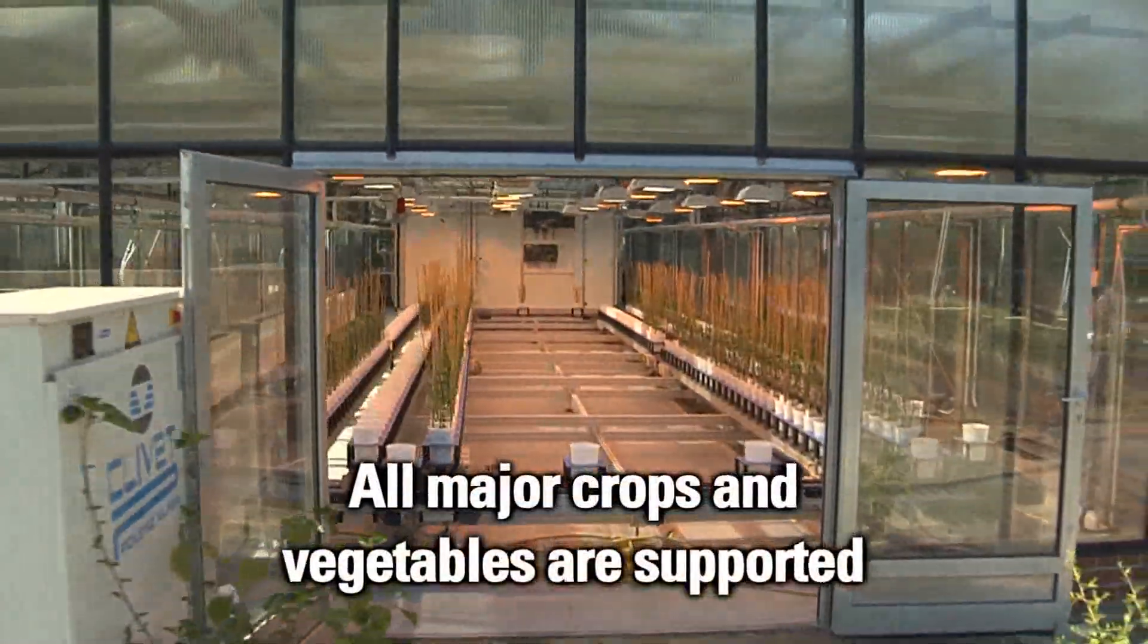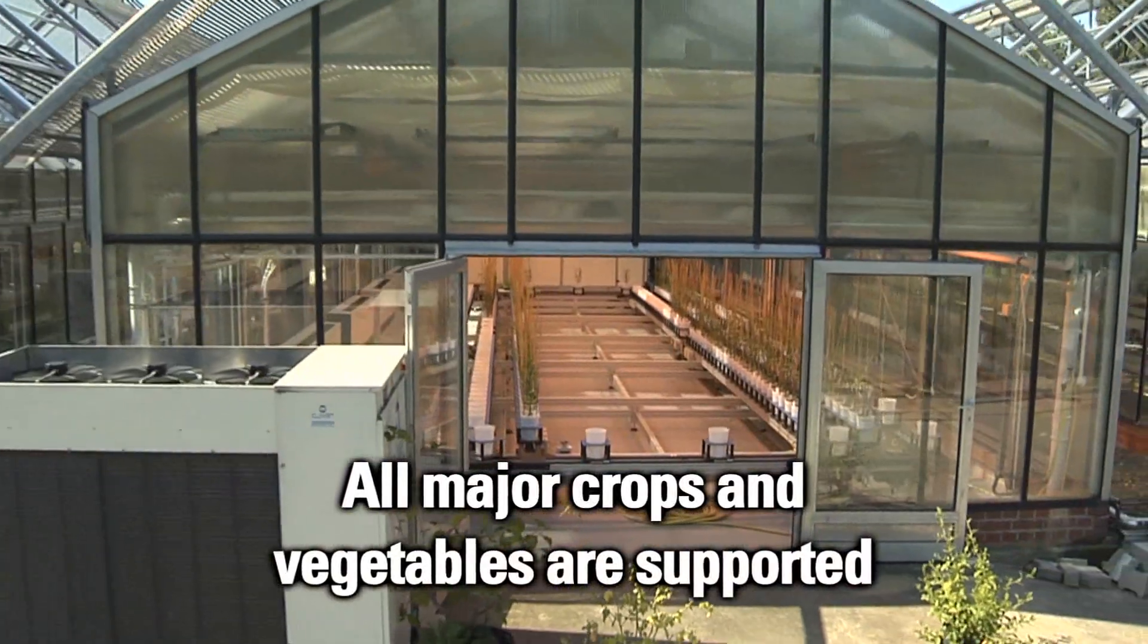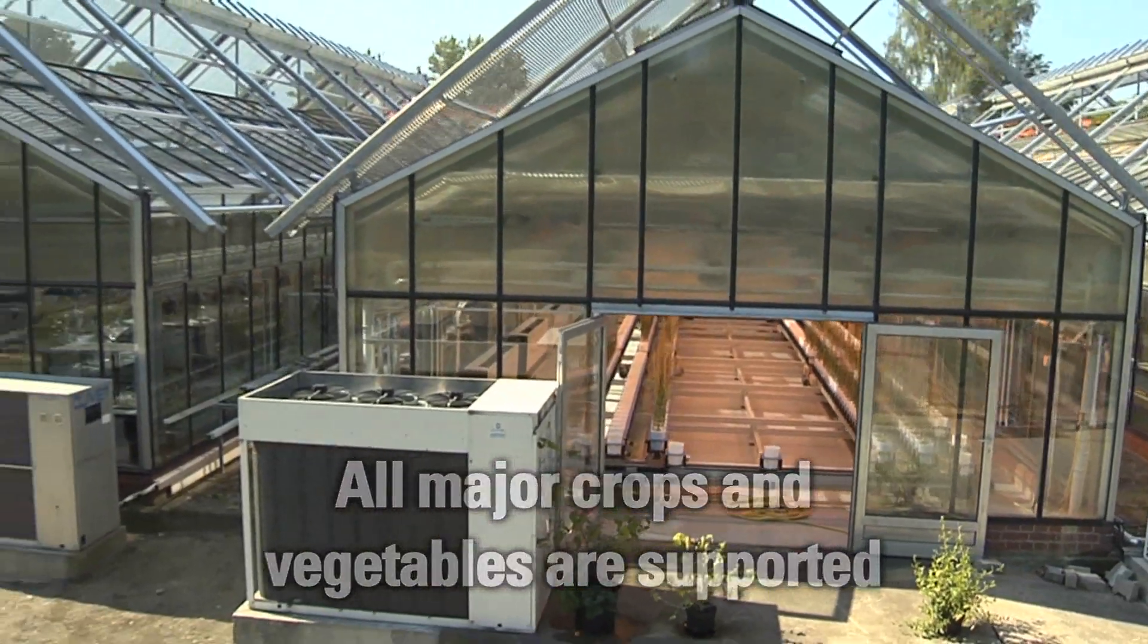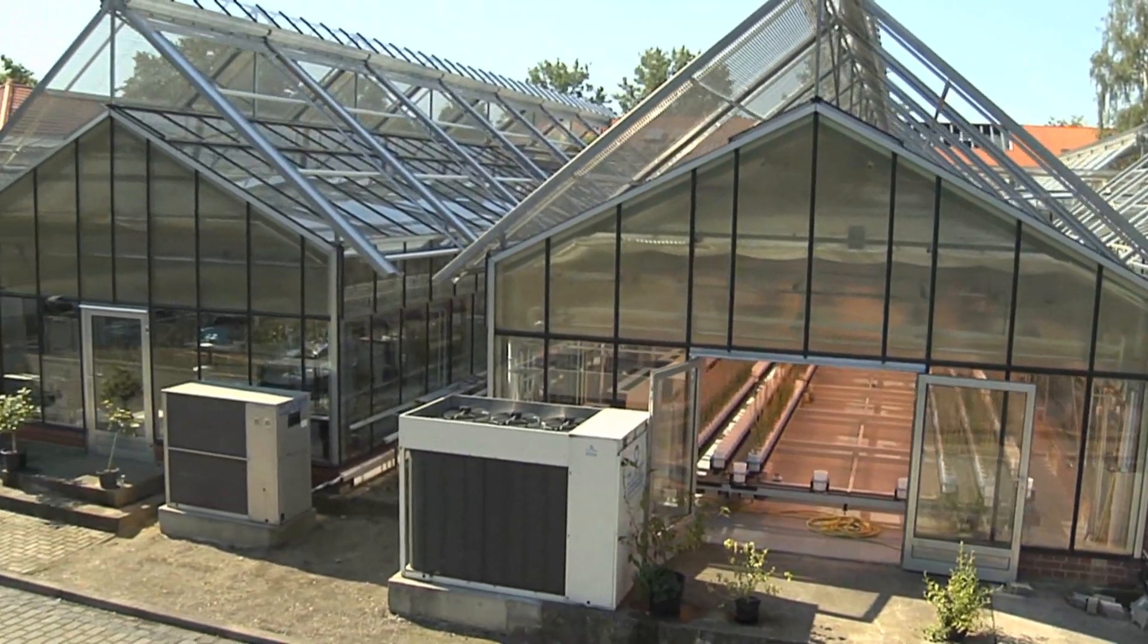The LemnaTec Scanalyzer systems can be used for all major crops and vegetables to provide reliable high-content phenotyping data.